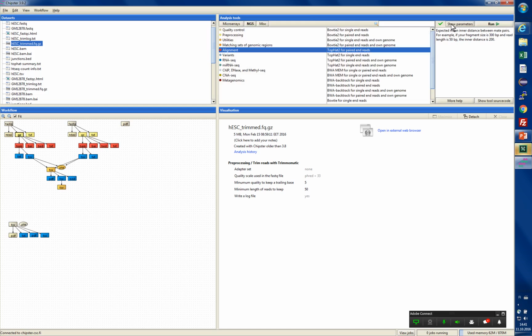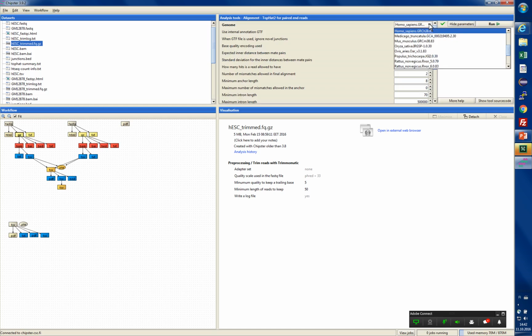So there was a question regarding the reference genomes. Ridul is asking if one can also align against the older version of the human genome. That would be here, they have slightly different names.